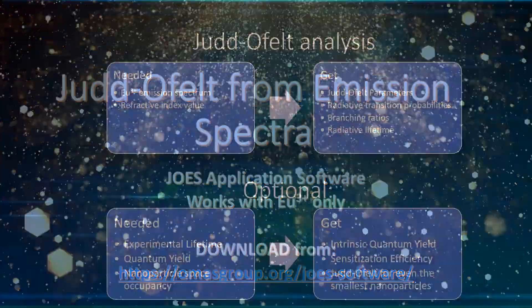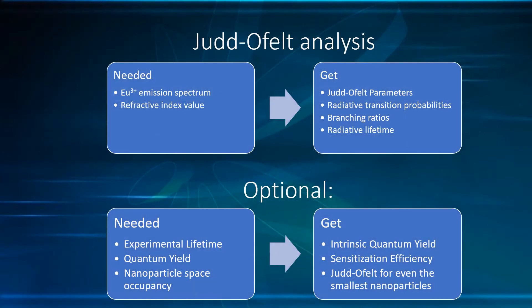For the complete Judd-Ofelt analysis, what is needed is a single emission spectrum and the refractive index value to get the Judd-Ofelt intensity parameters, radiative transition probabilities, branching ratios, and radiative lifetime.